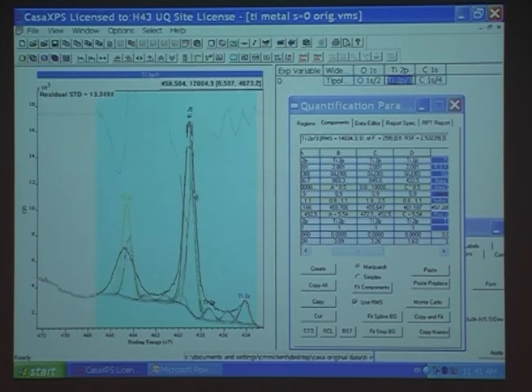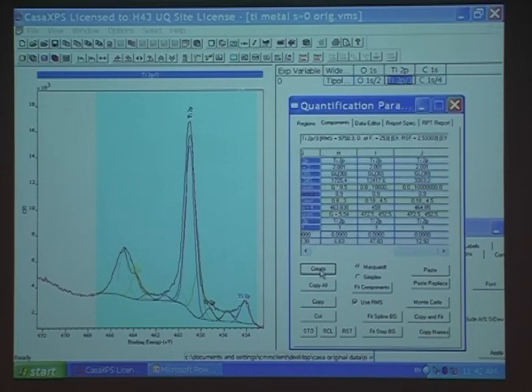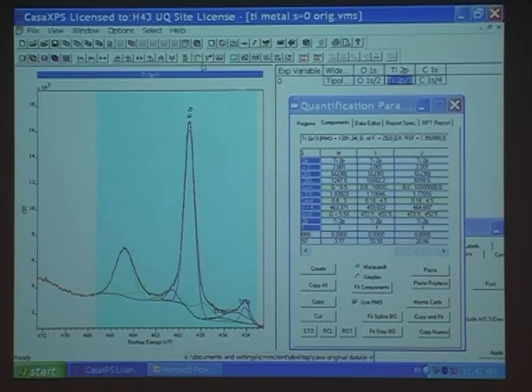Bring this one down into here. And then I might go create and create. Then I'll go fit. Aha, getting somewhere. Now I can look at the error, see what sort of error I've got here. Not too bad. This one's gone a bit wide and I didn't particularly want that. But I'm just showing you, I then have to go in and start restricting them.